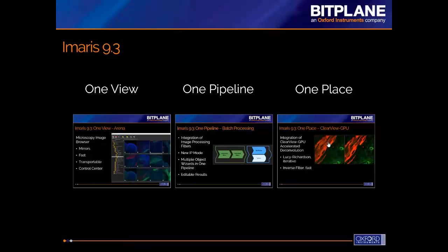You end up with so much data that it's not just on your workstation, it's not on the laptop that you take to and from work and take home to get some work done. You also put it on external hard drives, and oftentimes you have a nice institutional network server that you can put your data on as well.